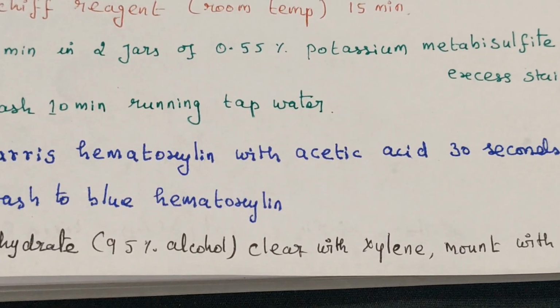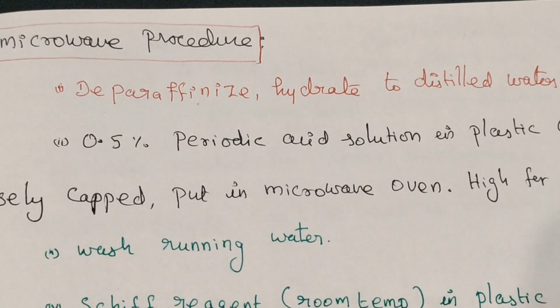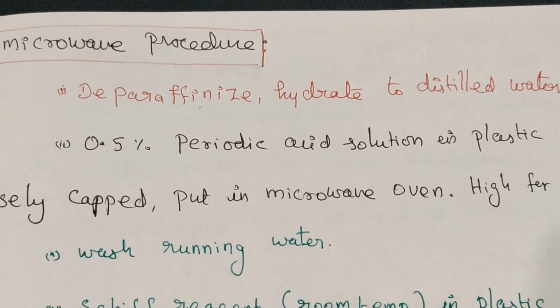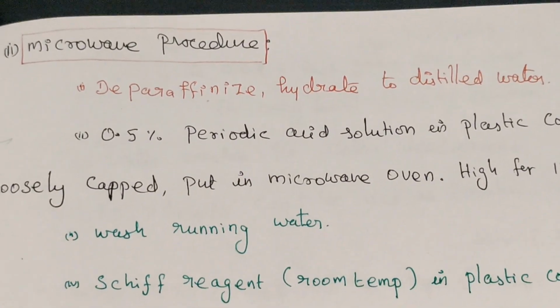Next one is the microwave procedure we want to discuss. There is also a microwave procedure. For this procedure a slide is needed. Deparaffinize, hydrate to distilled water.